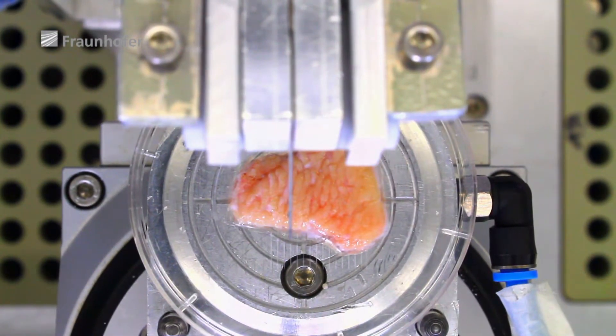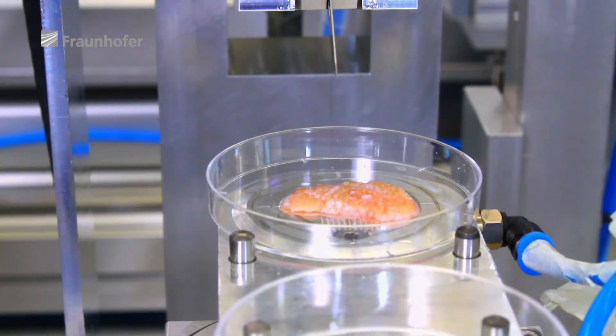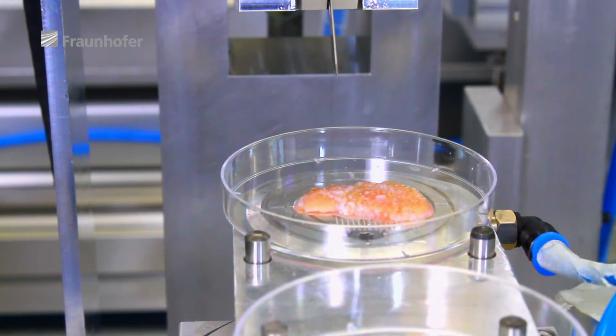But who would actually need artificial skin models like these? The initial target group for whom we developed this device includes companies that are involved in cosmetic, chemical, and pharmaceutical development, and that rely on the use of tissue for both risk assessment and impact analysis.